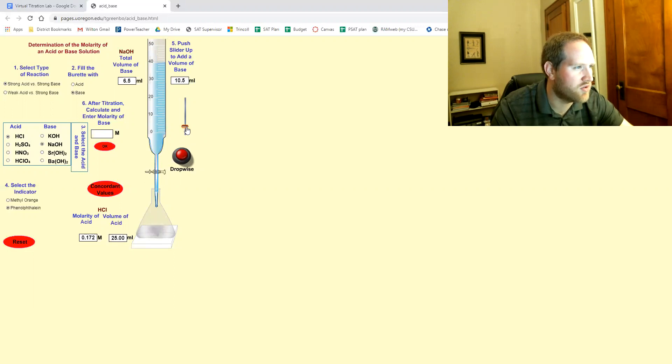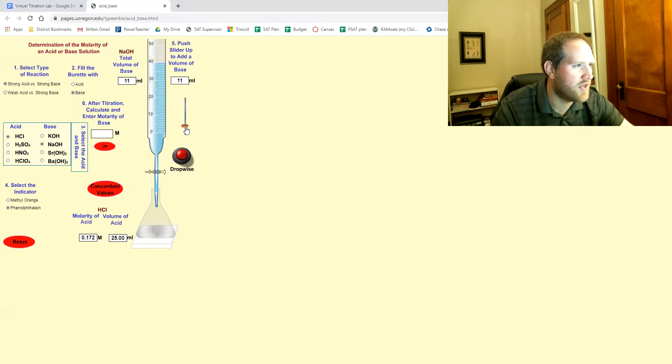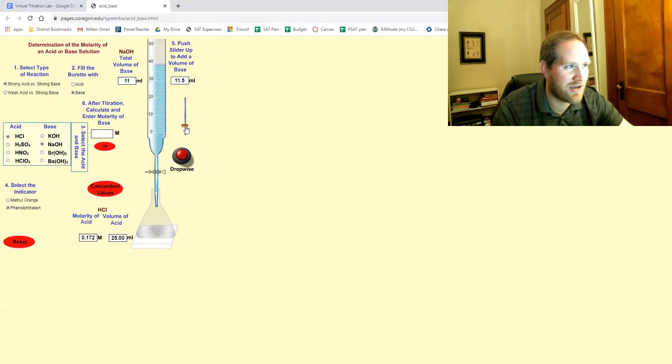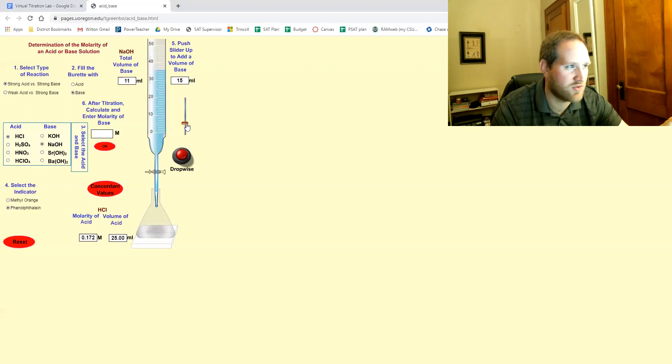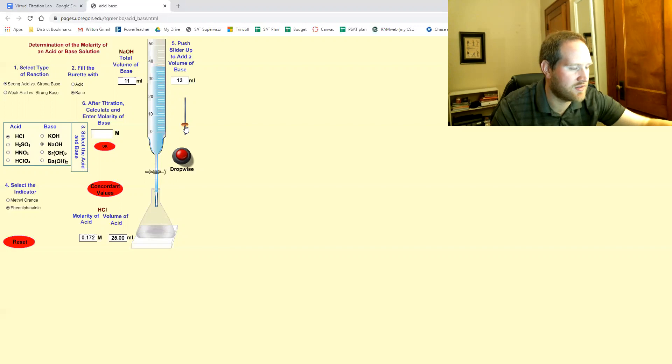Here's a little bit more. Again, I'm looking at the number. So I was at 11. Now I'm going to go to like 12, 13 or 14. So here's 13. Now I'm going to switch my attention down to the spinning thing.